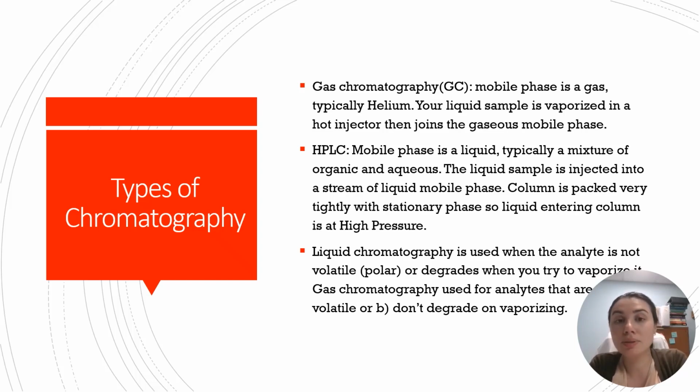Now, in terms of when to use one versus the other, you want to use liquid chromatography when the analyte is not volatile, or when it degrades if you try to vaporize it. Gas chromatography is best used for analytes that are volatile or don't degrade when vaporizing.